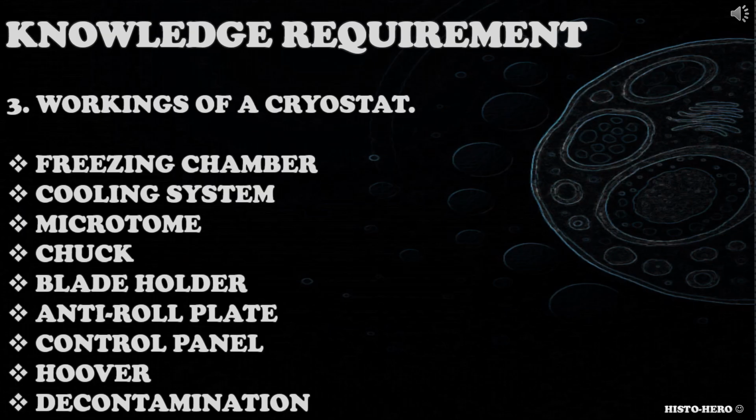When addressing this knowledge requirement, candidates should consider working parts of the cryostat like freezing chamber, cooling system, microtome, chuck, blade holder, anti-roll plate, control panel, hoover and their functions, decontamination options and so on.